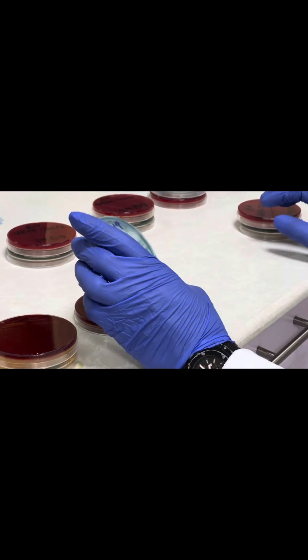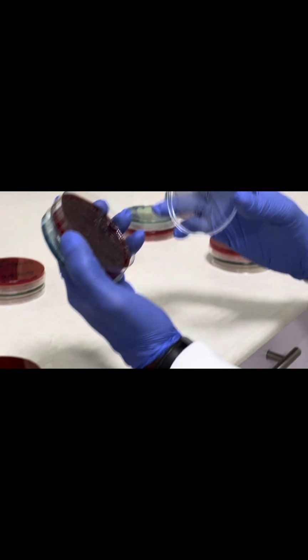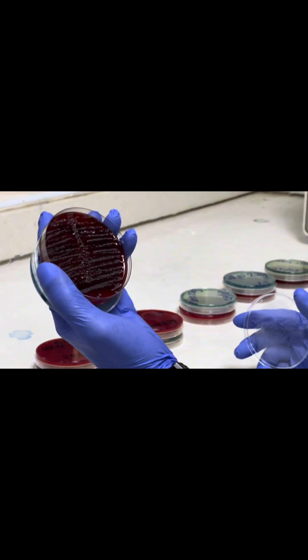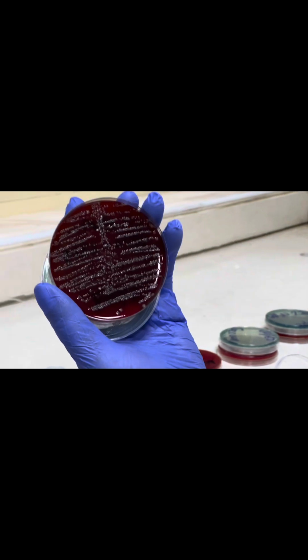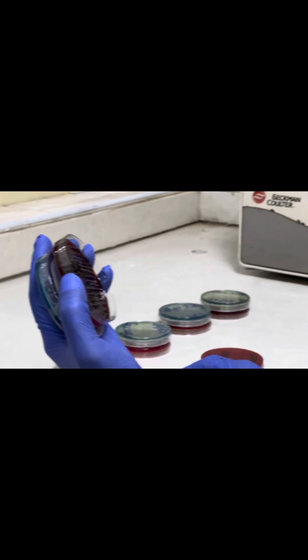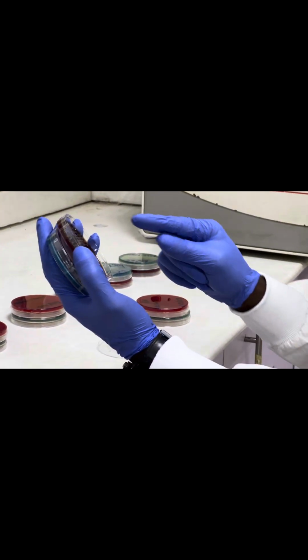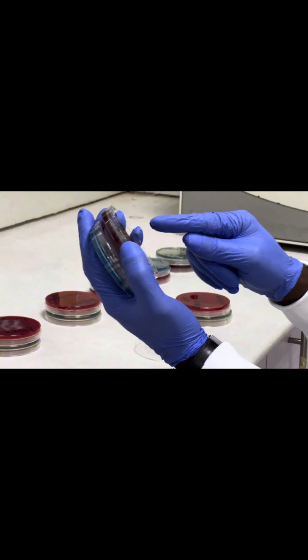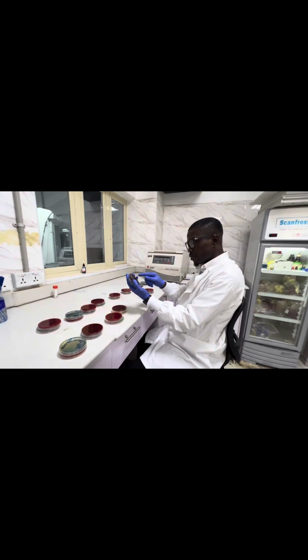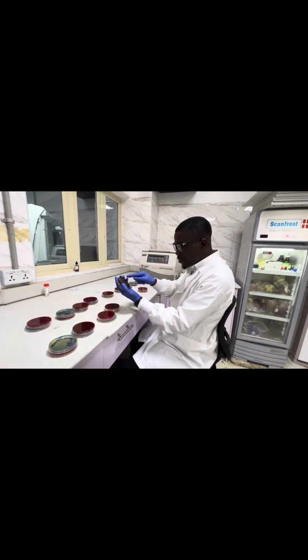And let's take, I think there is a, this is unique. Zoom in and look at it. From what I'm seeing here, the colonies are more than 2. I can see a very whitish one, I can see a grayish one, both of them small. Then I can see another very tiny one.